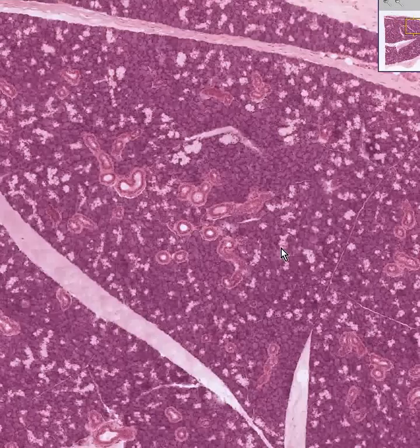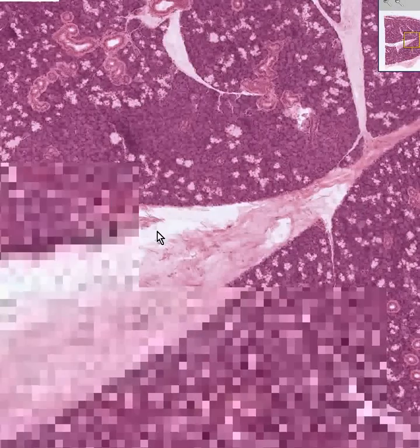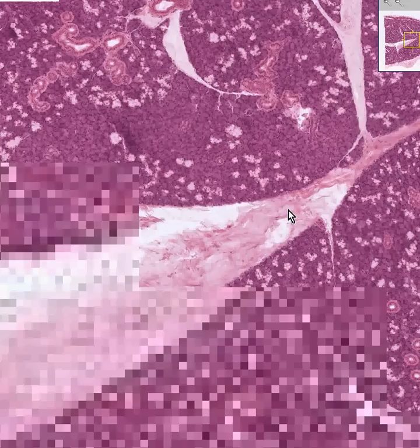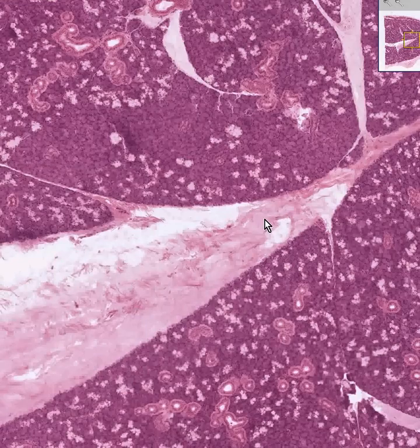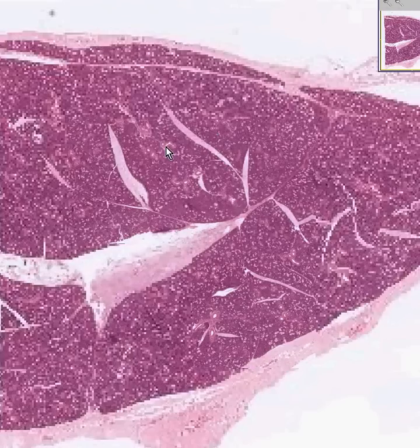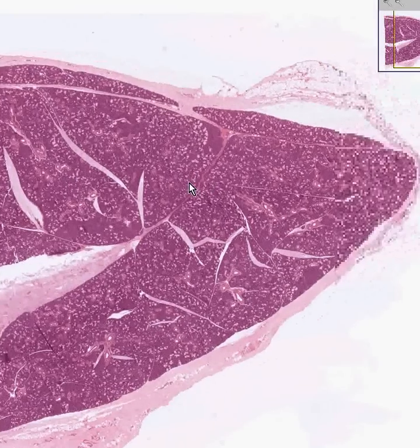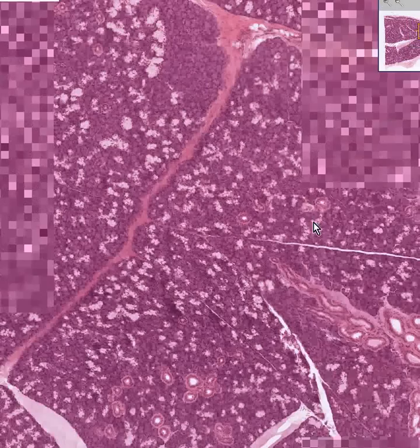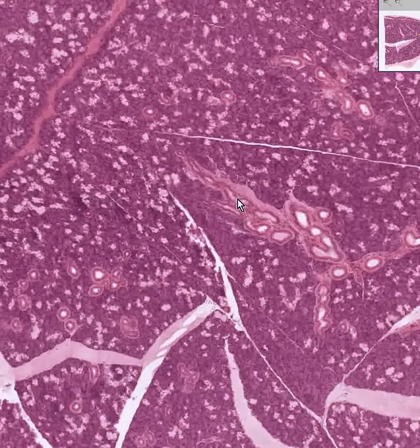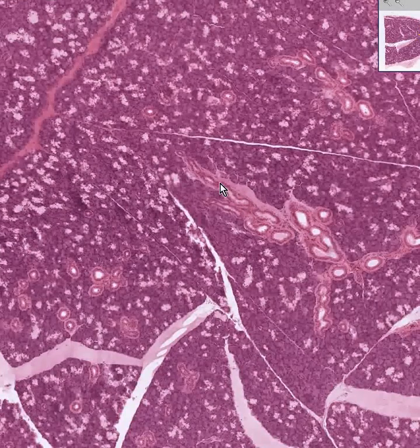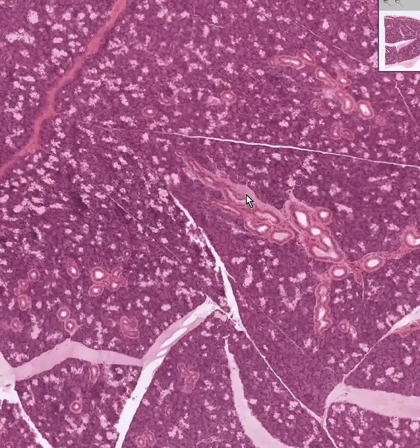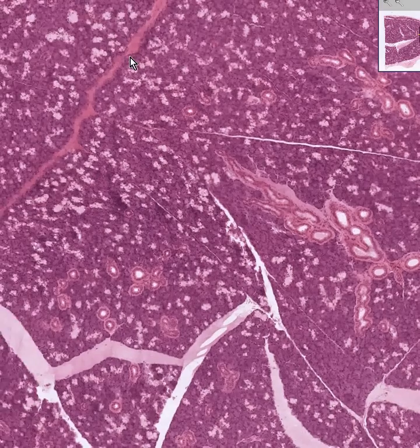The one other thing I wanted to point out is that between the lobules, if you see any ducts within the fibrous connective tissue septae, you could call those interlobular ducts. This might perhaps qualify as an interlobular duct if you truly believed that this fibrous connective tissue septum here was between lobules. I think I've given up on the possibility of intercalated ducts, because almost all of these are striated. So I thank you very much.